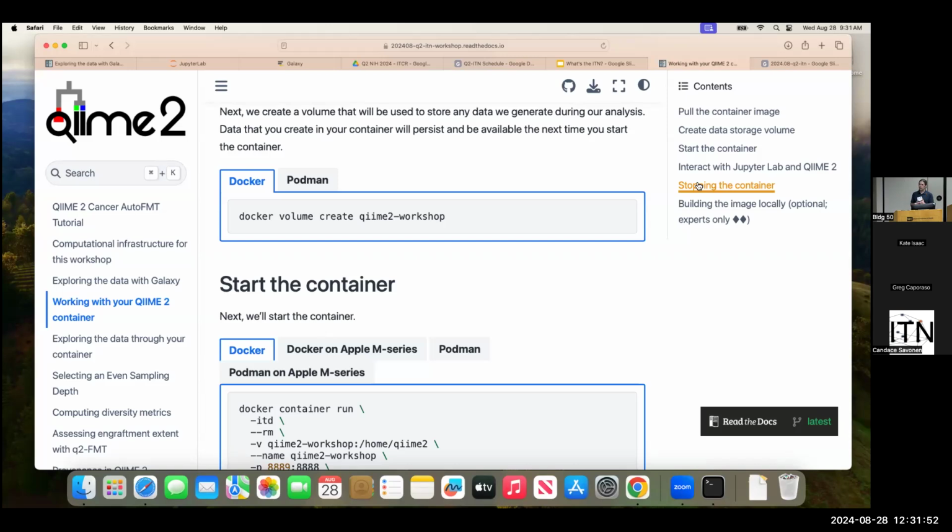So after we reorient a little bit, I'm going to turn it over to Chloe, and Chloe is going to go through several QIIME2 analyses that are pretty standard. Almost every workflow, every analysis we do, these are things that we integrate in that workflow.